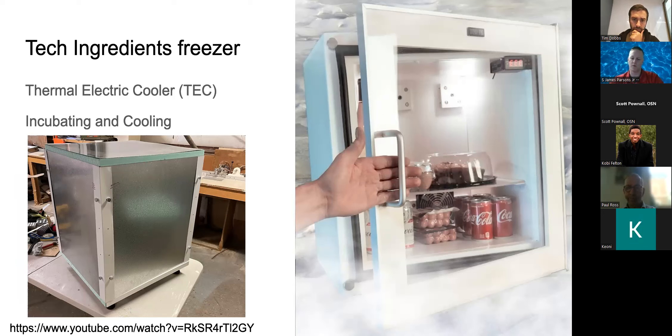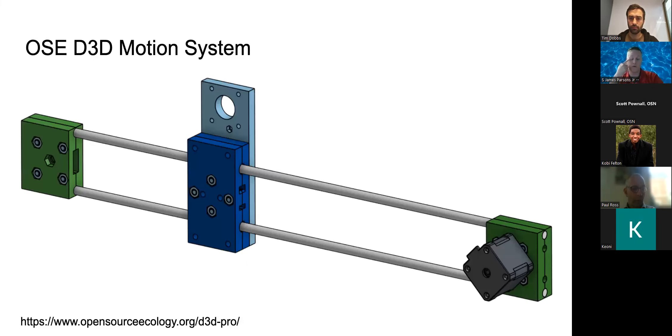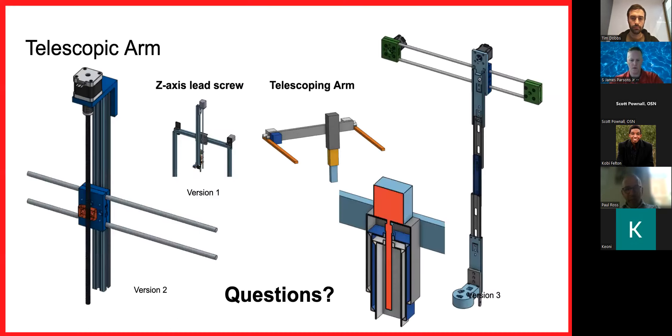The gantry I borrowed from Open Source Ecology's D3D 3D printer — very robust and plug-and-play. In my evolution of telescoping arms: generation one and two had Z-axes that went outside the build volume. Generation three uses an array of slide rails in a nested three-stage arm, giving me the ability to navigate between tall objects like bioreactors while moving within Celerator.